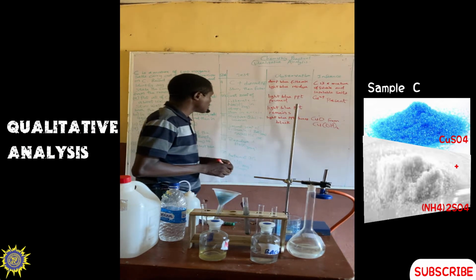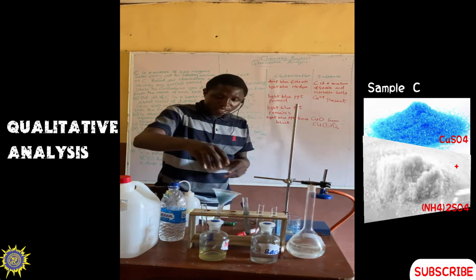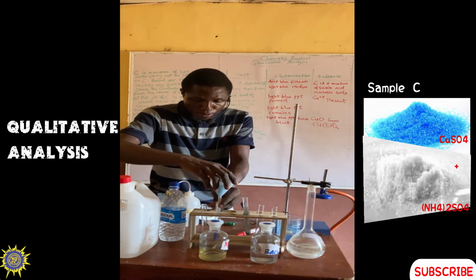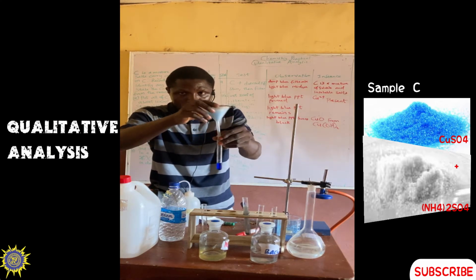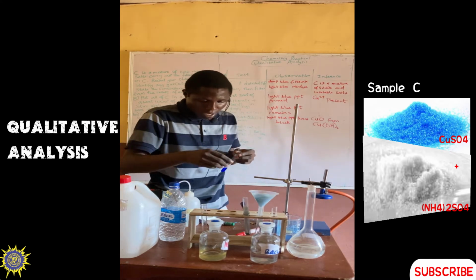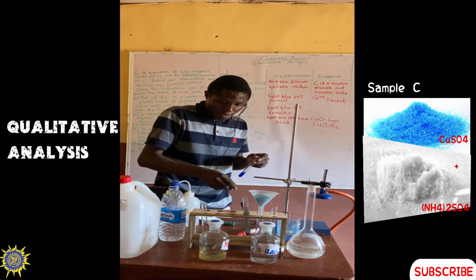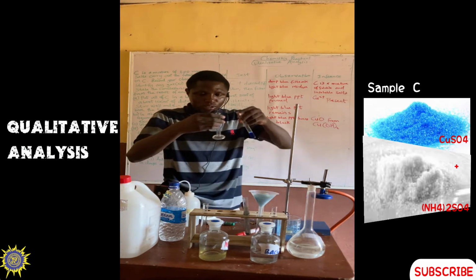The second 2 centimeter cube of filtrate plus barium chloride. Now the second 2 centimeter cube of filtrate. So now let's measure another 2 centimeter cube of filtrate.